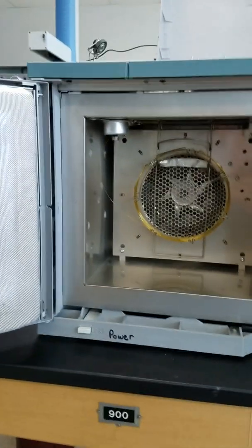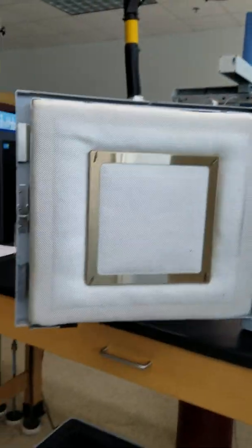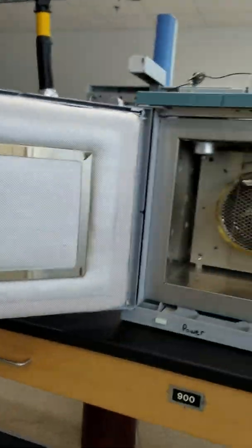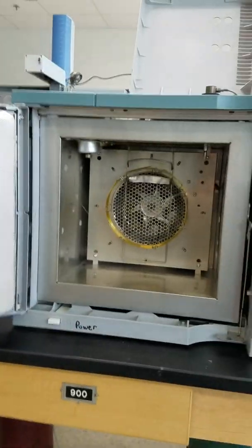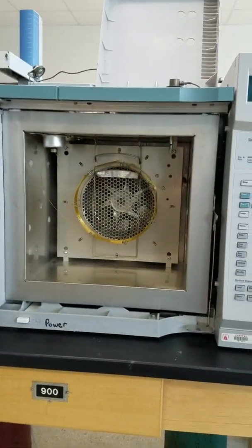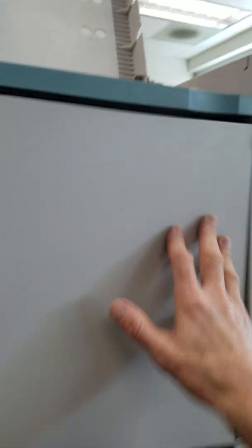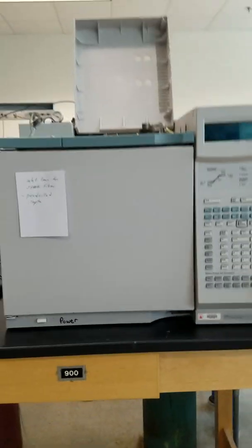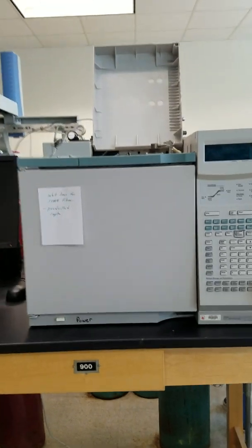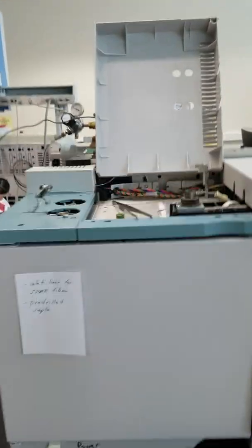I'm going to leave it at that. You've seen the instrument. I've given you a brief overview of the GC FID instrument that we're using.